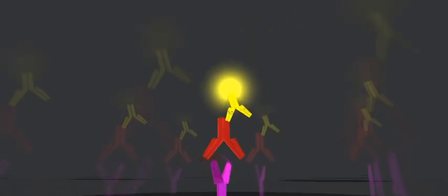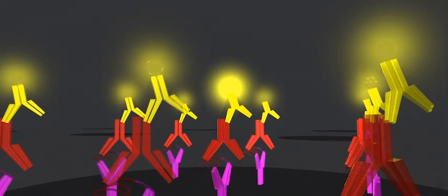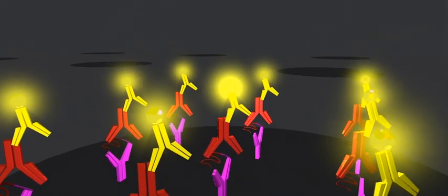When the patient antibodies bind the appropriate signal proteins, we can light them up with a secondary antibody.